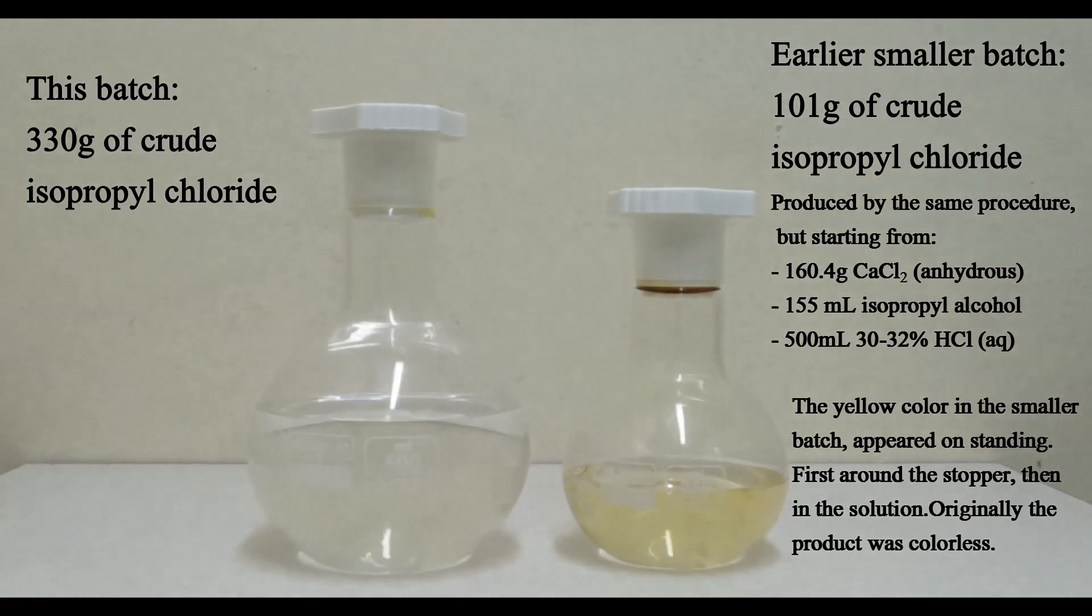On the left in a 500 milliliter one-necked flask is 330 grams of our crude product. On the right in a 250 milliliter one-necked flask is 101 grams of crude isopropyl chloride produced in an earlier run. I decided to combine both products and work them up together.